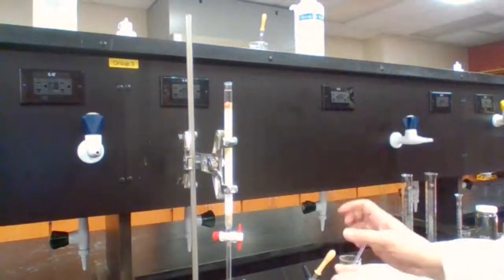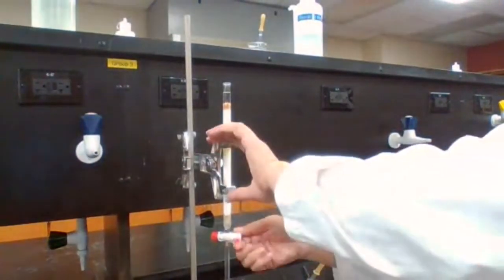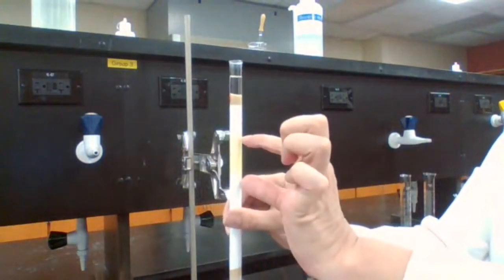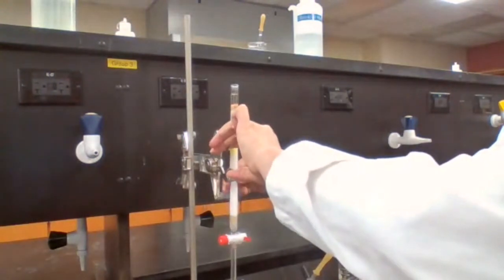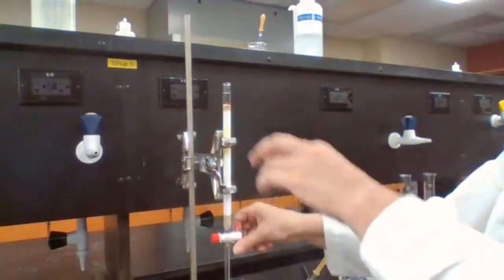Okay, this part doesn't take long because we're just looking for a yellow band. And if I bring this closer, you see that we have that yellow band out here. So I can switch my solvent to acetone now.